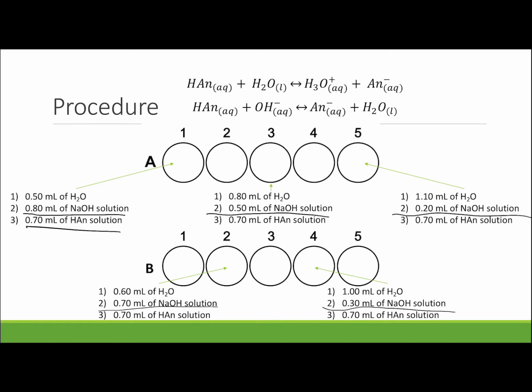He took 5 wells, A1, B2, A3, B4, A5. He staggered them, so when he put the pH probe in, he didn't cause any spillage into a different well. You hopefully remember a well plate from our Le Chatelier's principle lab. It looks something like this.